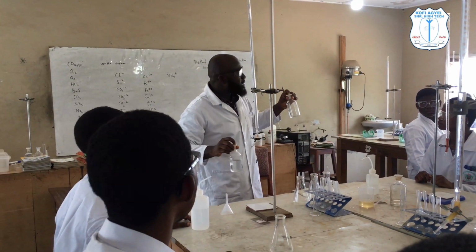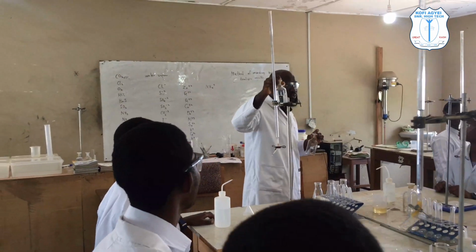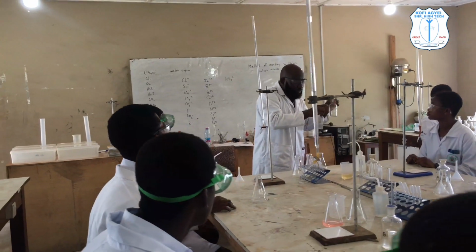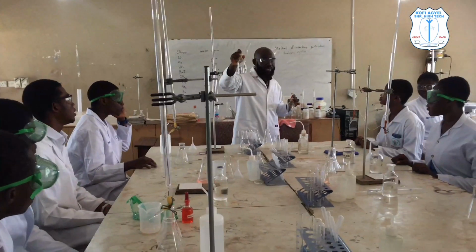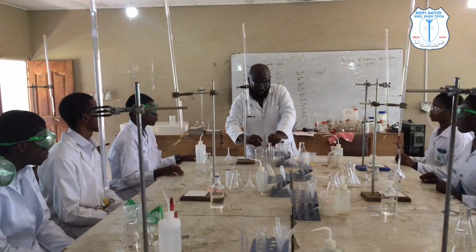Now with simple titration, always one of the reagent bottles contains an acid. Another one contains what? A base. Do you get it? So here let's assume there's an acid in this one. You would have labeled this one as what? A. Understood? So this one is the acid and this one is what? The base. So here we are going to perform simple titration.